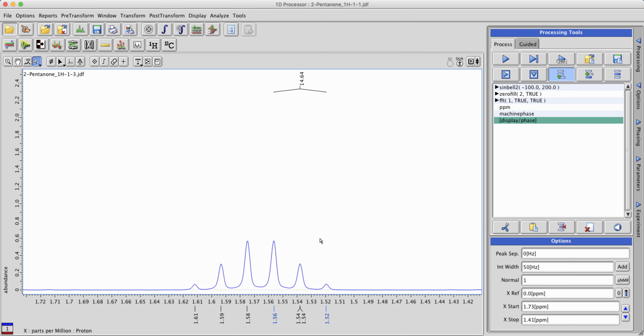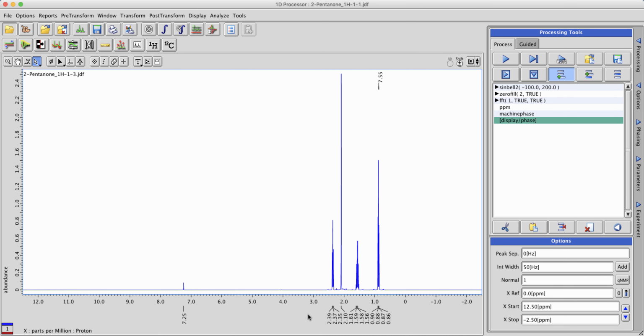If you'd like to delete peaks or the center of a coupling constant, simply left click so that the peak shows up in blue and hit the delete key. You could also click, drag, hold, and release to choose multiple peaks and hit the delete key. Or if you'd like to delete everything in your spectrum, press the A key while the selection cursor is chosen.